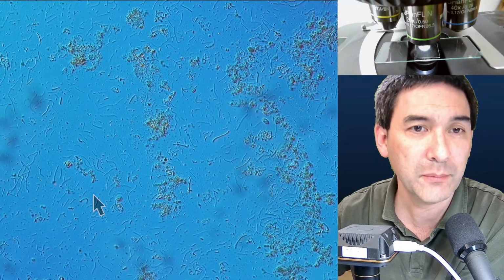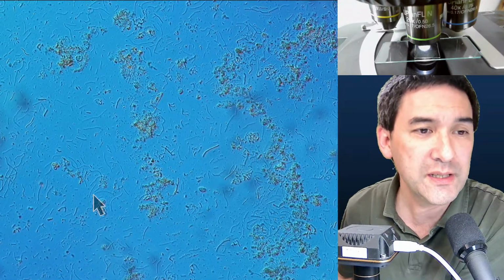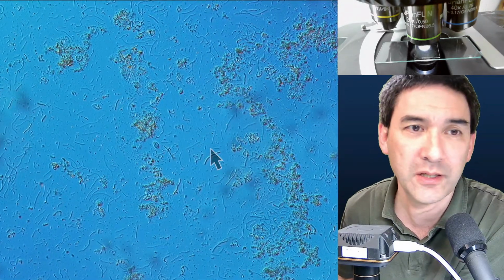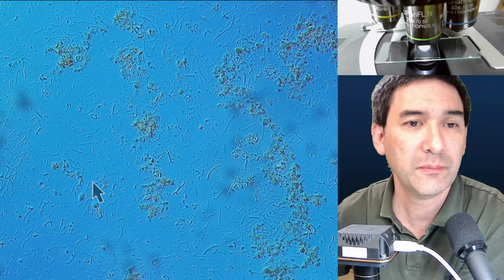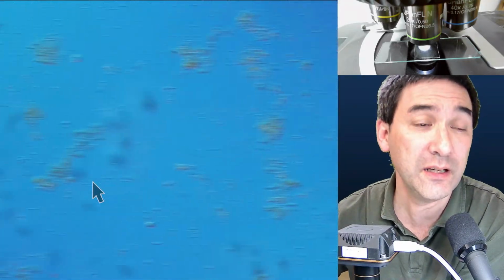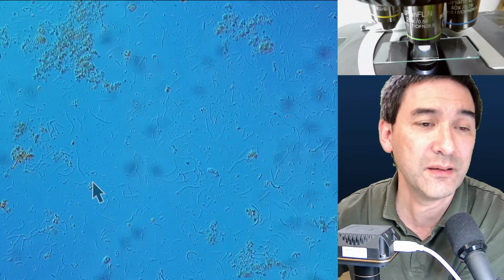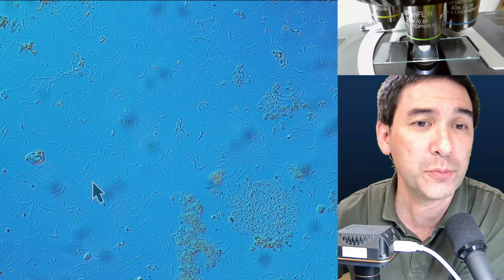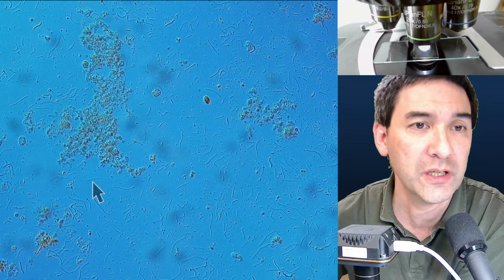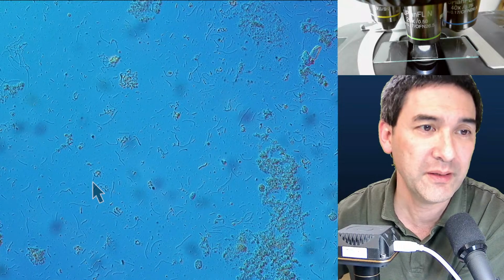Here, for example, because at the side of the cover glass you have a higher oxygen concentration. And all these lines here are almost certainly bacteria. This is actually a sign that if there are many bacteria present, then ciliates like Paramecia and so on are not going to be present so much, because they consume so much oxygen.